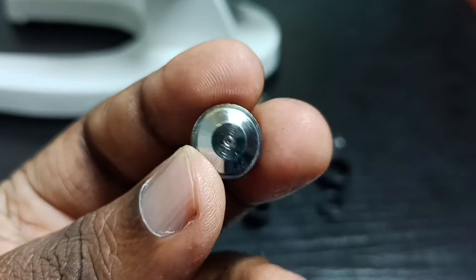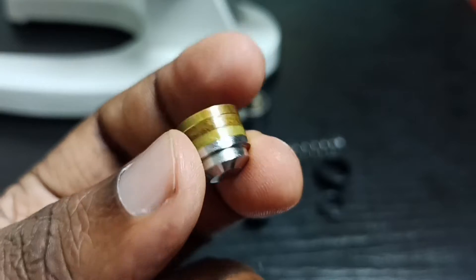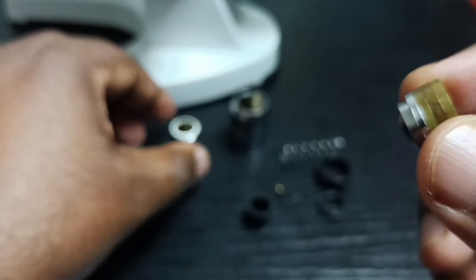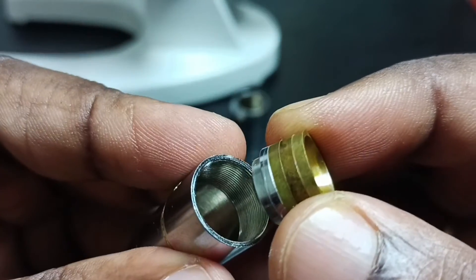After cleaning, I will show you how we can put everything back. First, we have to put this lens back inside here.